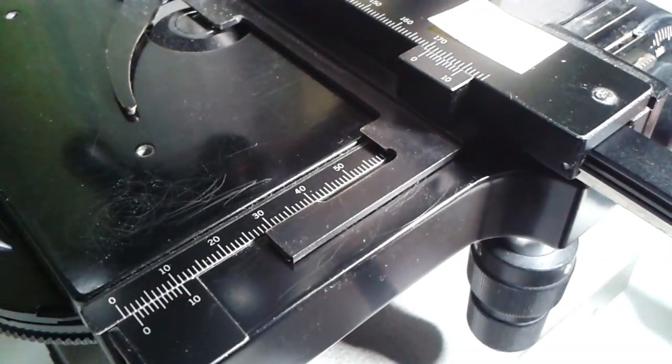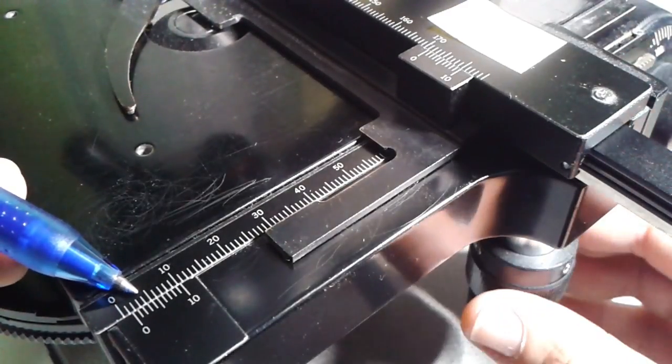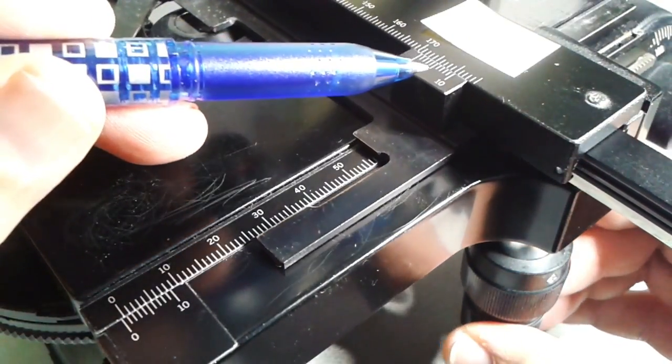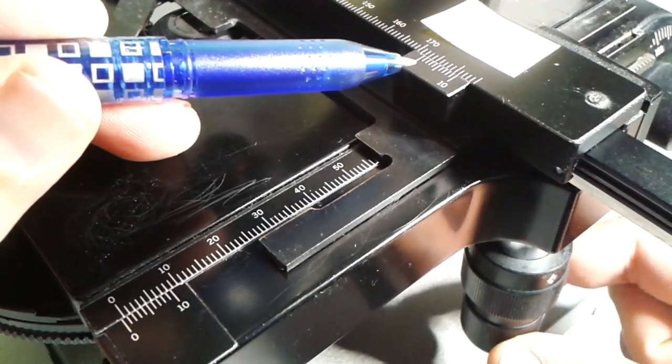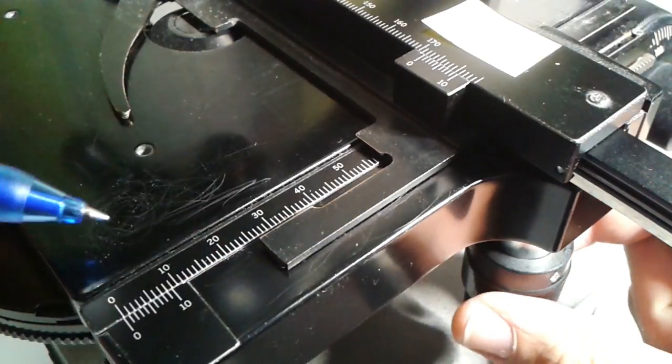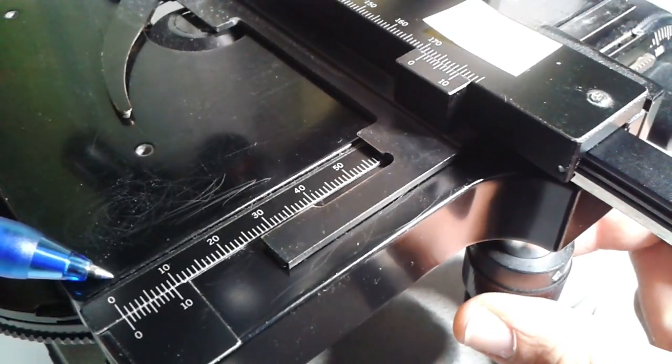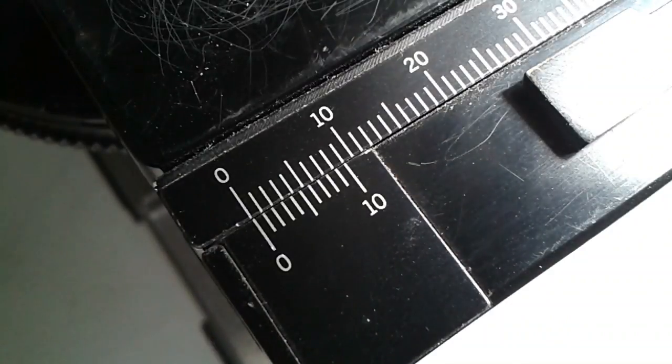So there are actually two stage calipers, one for the x-axis and one for the y-axis, and by moving the stage you can see that the small scale in this case also always moves in relation to the larger scale and this allows for a very precise positioning and also for measurement of certain things under the microscope.